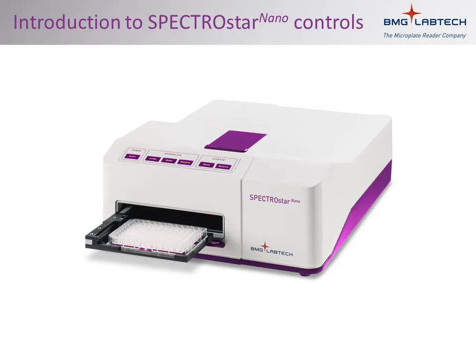This video will serve as an introduction to the controls that are available to you for the use of the SPECTROstar Nano, both on the front of the reader and in the software. It is meant to be a very broad overview. Specific functions will be addressed in other videos.